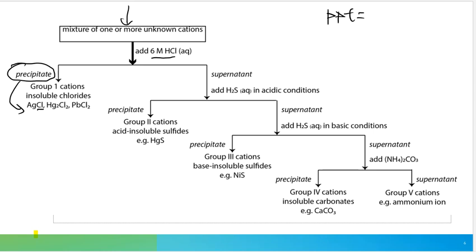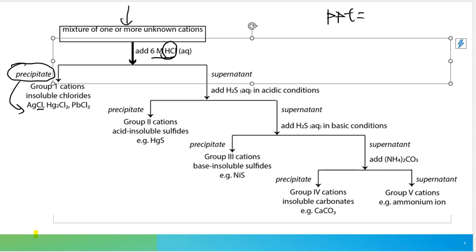If you add that silver nitrate to our HCl, the silver nitrate will precipitate out the silver chloride and make a precipitate that we can see in the test tube. In the lecture portions of the laboratory assignments, we'll break down the tests you did in more detail, but this is where a lot of the chemical identification tests originate from.